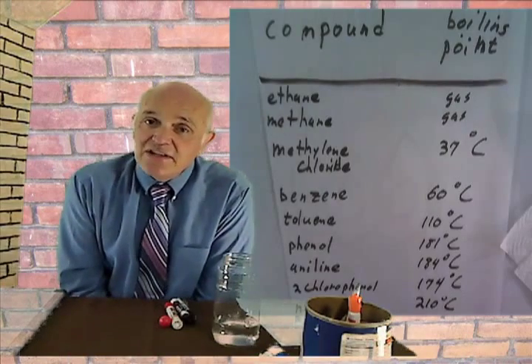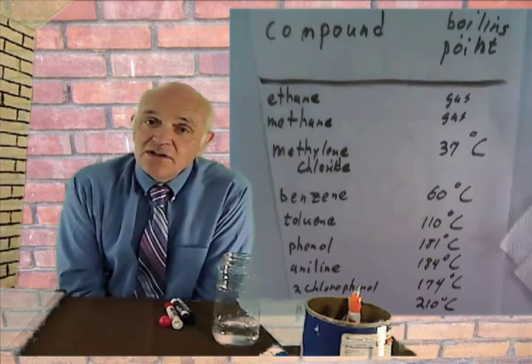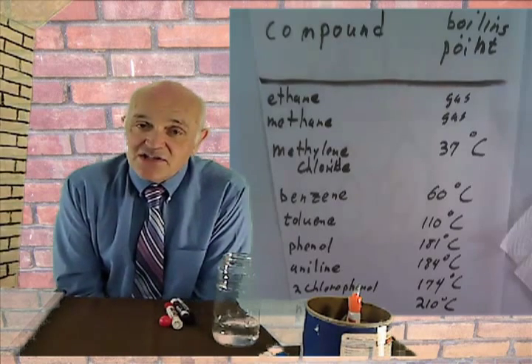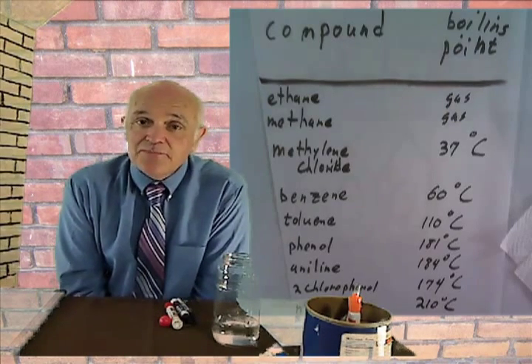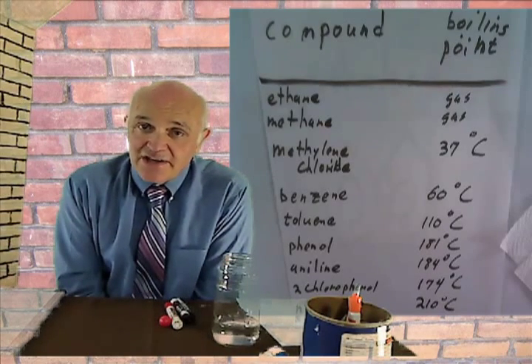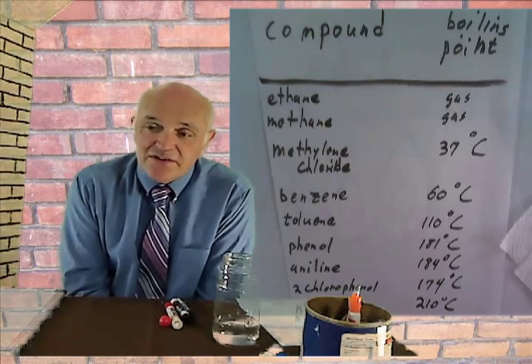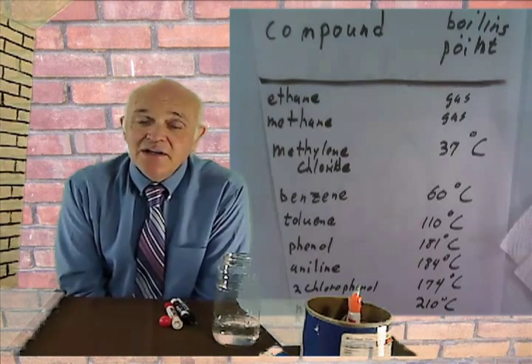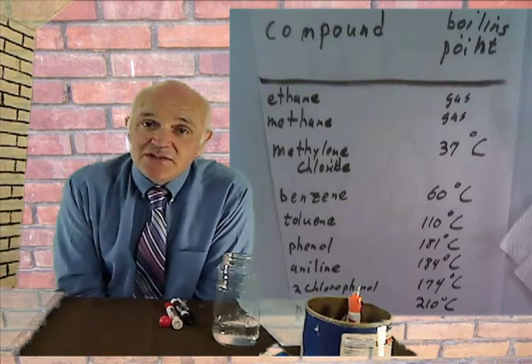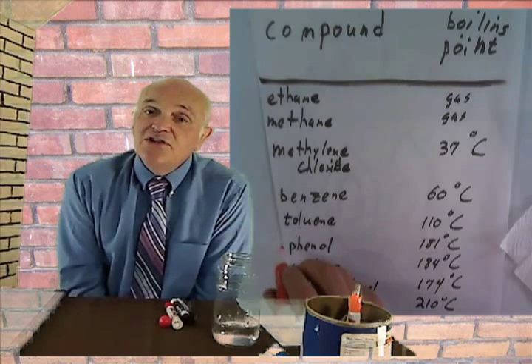The 8270 involves a complicated extraction. The extraction and the condensation, let's look at this for the time real quickly. 3 samples come in from the Walmart site. They want to build a Walmart. The consultants say we need an 8270 from this spot, and this spot. The lab gets 3 samples for 8270. The technician is going to do 6 samples.